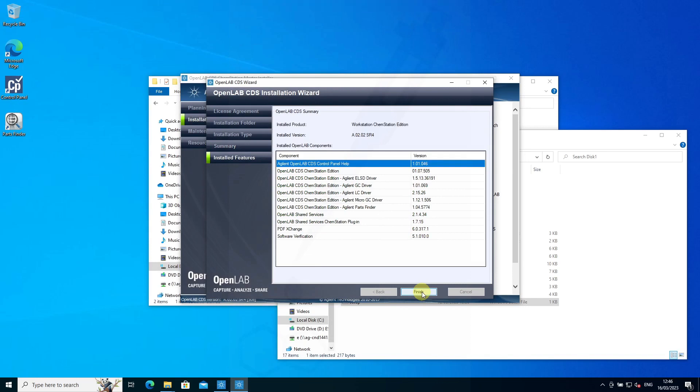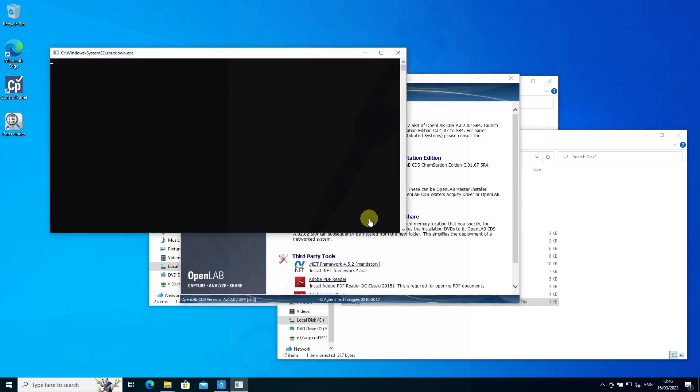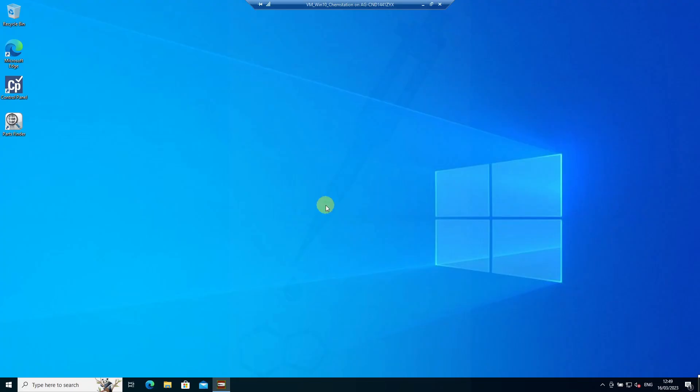We can then finish. We might have to restart, and that's what needs to happen next. The next step after the restart is starting the control panel.